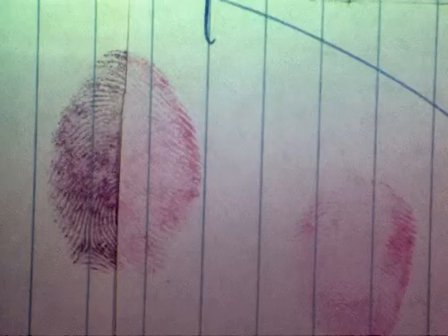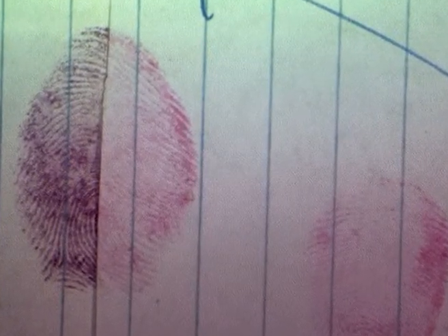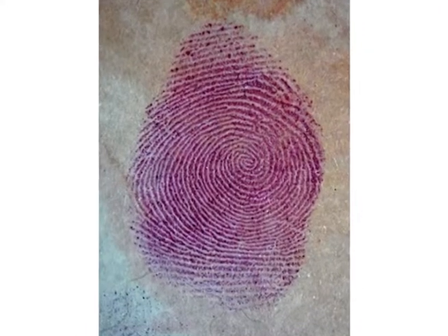Broadly, the procedure for developing latent finger marks involves spraying the Ninhydrin solution on the surface containing the impression from a distance of about 6 inches. After the solvent evaporates, the solution is re-sprayed. The surface is then heated for a short time without allowing it to come into contact with the heat source. If quick development is not required, the item may be allowed to dry at room temperature. Better results are obtained by natural drying. A sample fingerprint developed by Ninhydrin method has been shown on your screen.